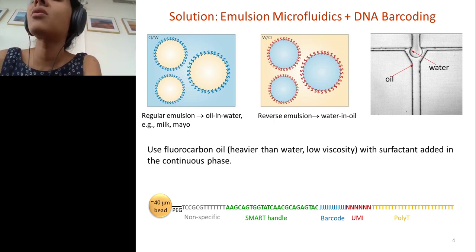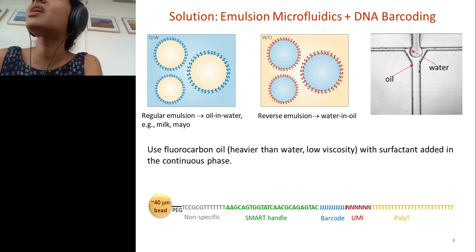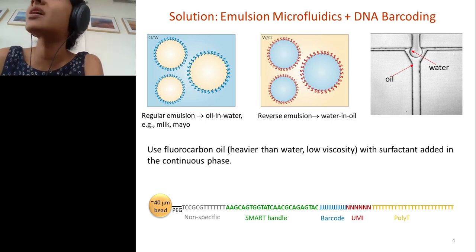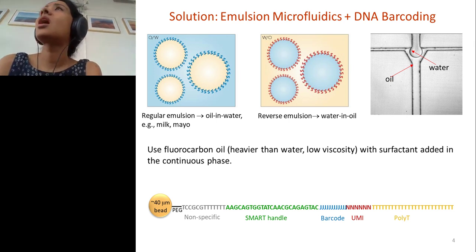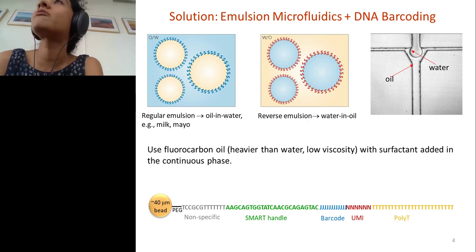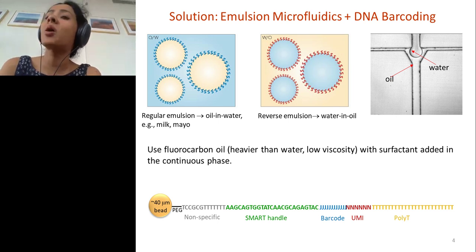So mammalian or eukaryotic messenger RNAs have a sequence of A's on the end of the messenger RNA molecule. The poly-T allows us to select out the messenger RNA from all the other types of RNA that is present. I should mention that the microRNA is a small fragment that is present. They are also very informative, but not for the purposes of classifying cell types. So we are going to ignore those for the most part.